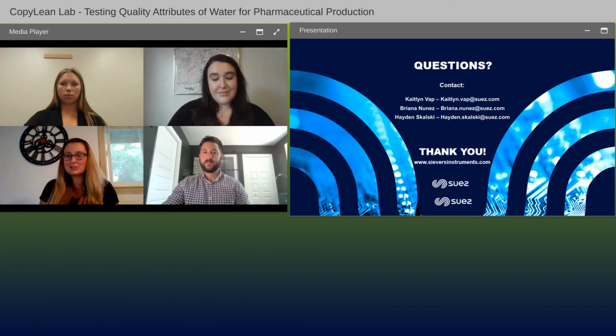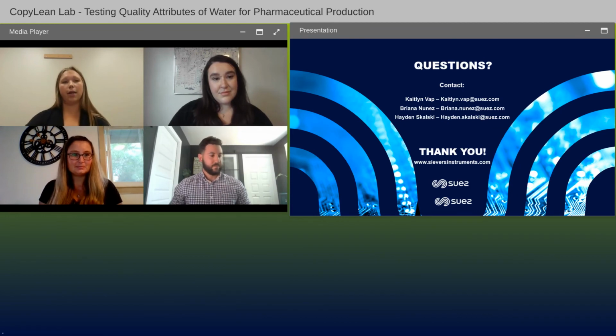What should I consider to complete a failure mode and effects analysis? Great question, because this is a really important factor when implementing real-time testing. When you're considering a failure mode and effects analysis, or an FMEA, in the context of real-time testing, what that is used to inform is where you end up placing the instrument of record, the online instrument, and also which critical points of use exist that should be tested against the water quality at the location of the instrument of record.